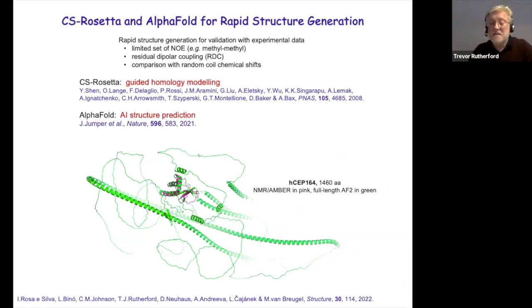Nowadays, we are exceedingly excited by the development of the artificial intelligence algorithms, and particularly AlphaFold and what they're doing for protein structure. NMR is going to be one of the huge beneficiaries of AlphaFold, because the slowest step in NMR solution structure generation was doing de novo solution structures in the first place.